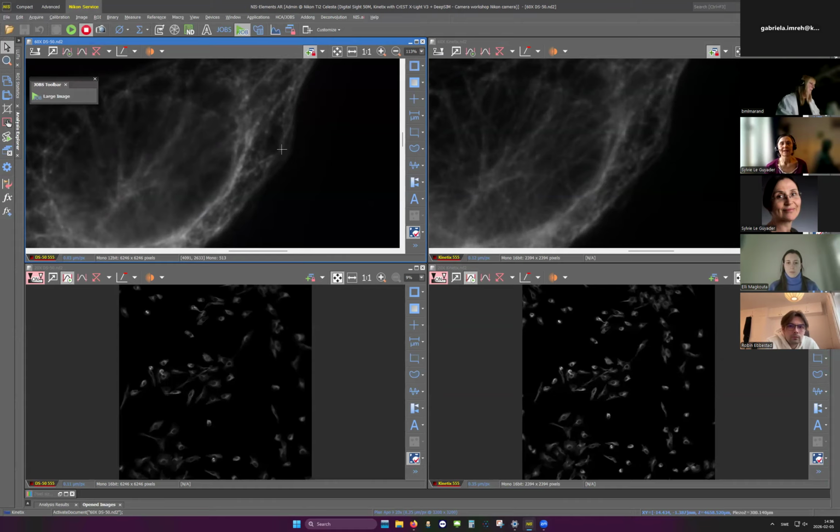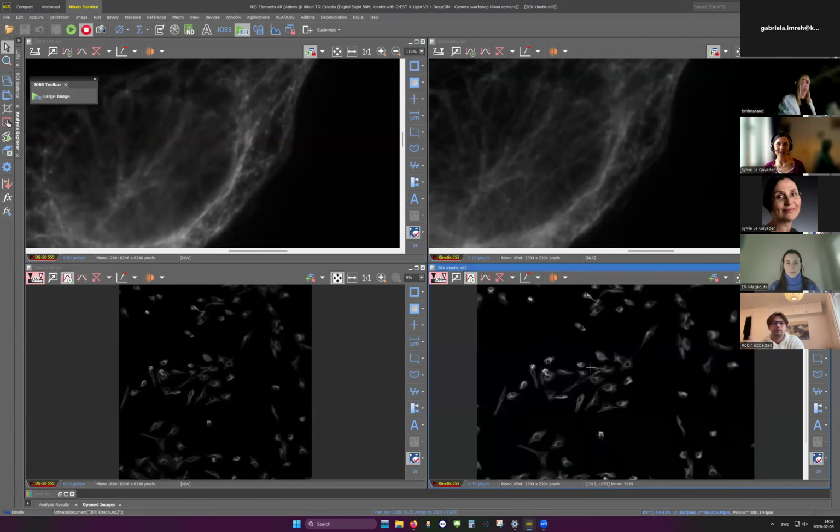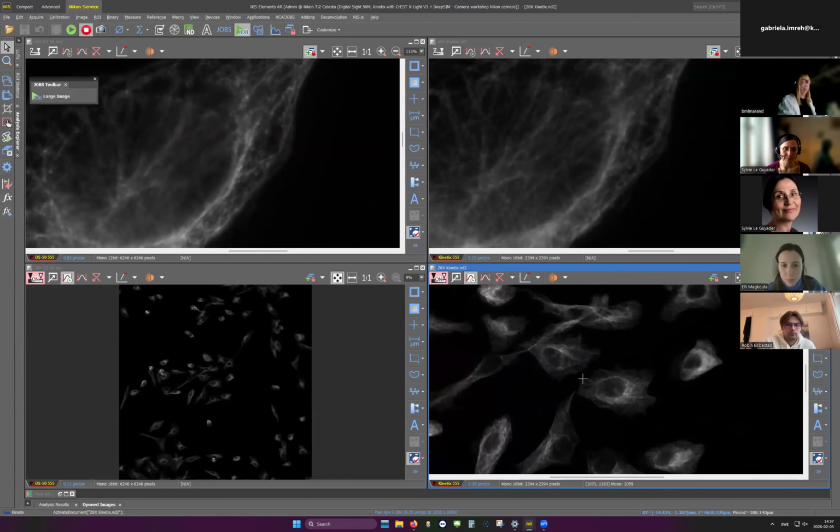As I said in the lecture, in the course we calculate with 2x for the Nyquist sampling, just for simplification, but actually for a camera, normally we should use 2.3. This is the Nyquist sampling factor that we spoke about.